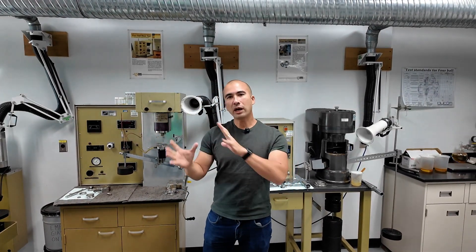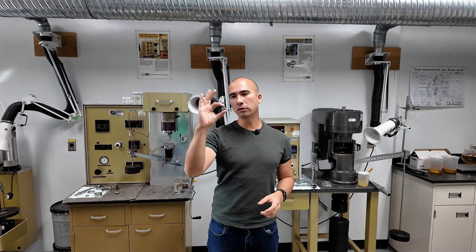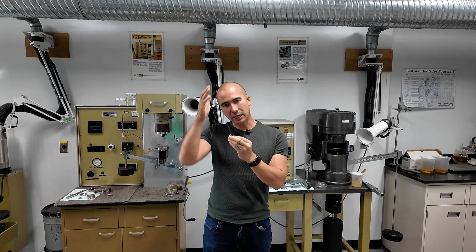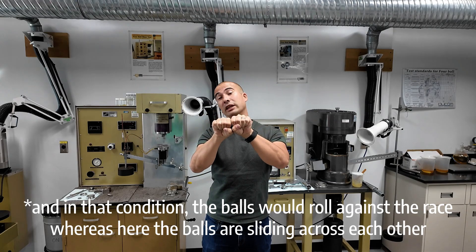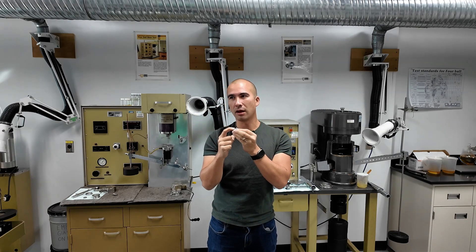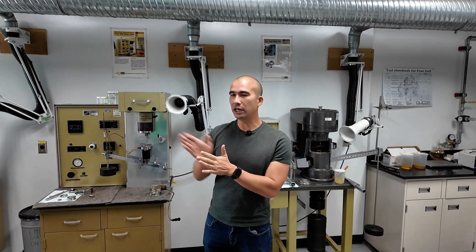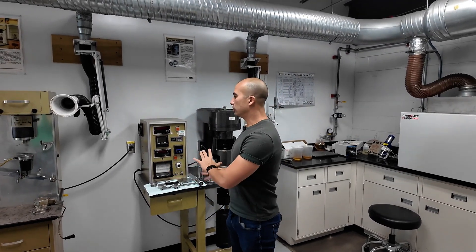One thing about all of these bench tests: we are always trying to simulate lubricated conditions, but we're taking it to the extreme. In the case of the four ball test, in what kind of lubricated system do you ever see point loading? The reality is it never happens. The closest we probably have is a rolling element on the inside of a race, but even then it's a point against a flat surface. Sphere on sphere is not really a condition which we ever lubricate, so this is a very extreme condition that you don't really see in the real world. These are screening tests — we're using this as a way to screen formulations.